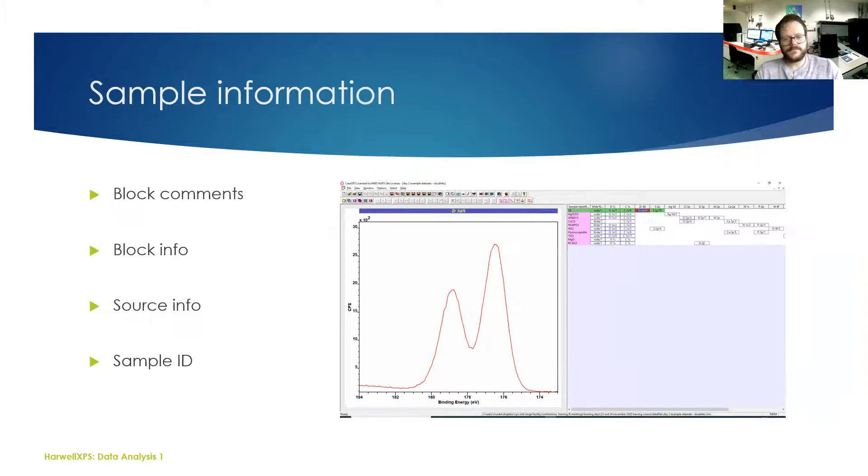Some of this information is accessible through some of those options in that bar on the top. There's four options here which bring up some of the experimental parameters which are going to be very useful if you are writing a report and you want to remember what the spot size was or what the X-ray power was. All of that information is stored in that VAMAS block.